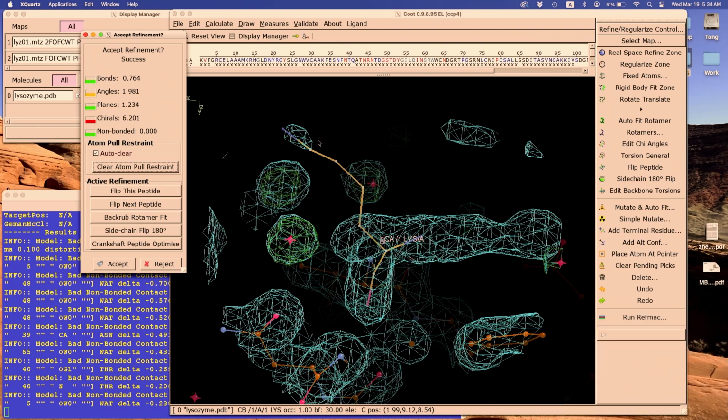So, go to Edit, Preferences, Refinement Toolbar, Icon and Text, and then say OK. That way you see everything. So when I tell you something, these are the commands.